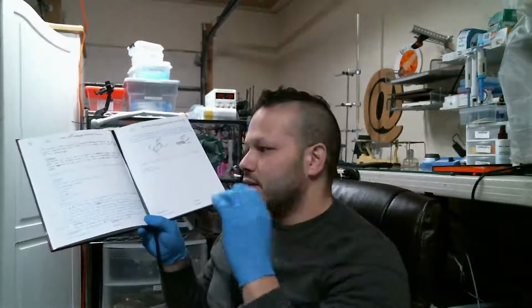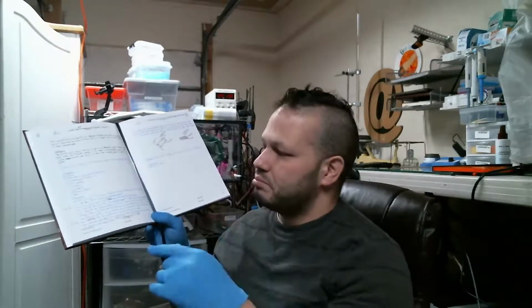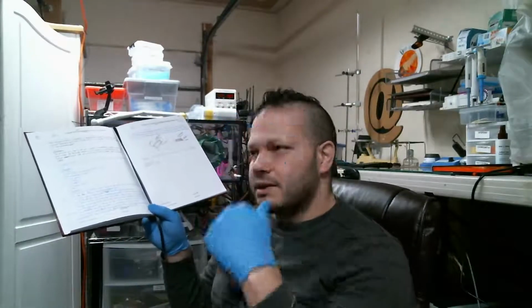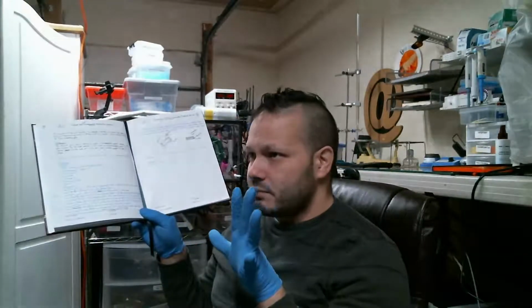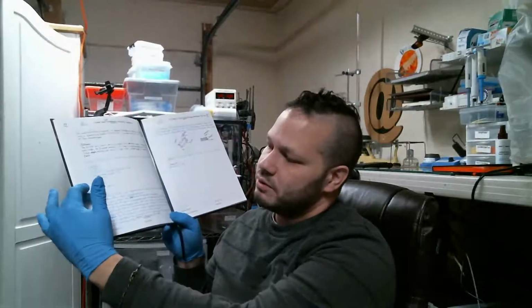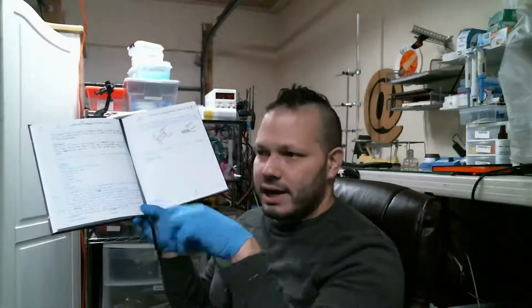First I write down every supply that I need, whether it's a pipette or a beaker, the exact size of the beaker that I need, microscope slides, or whatever. Every little thing, even something as small as scissors, if I need scissors for it. I think of everything that I possibly can use in this experiment. That way, I'm not running around trying to get scissors or hydrochloric acid because I don't have it at the bench. So I write it all down, so when I start, I can get every last piece of equipment and chemical that I need and lay it out right on the table. That way it's right within reach.